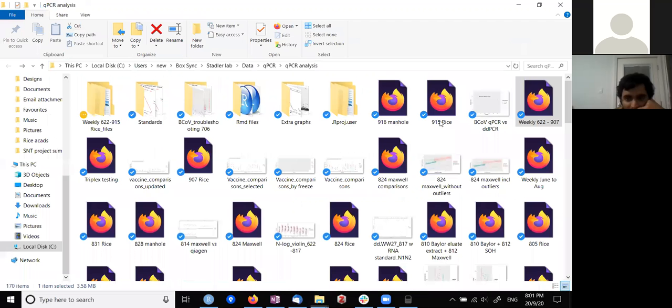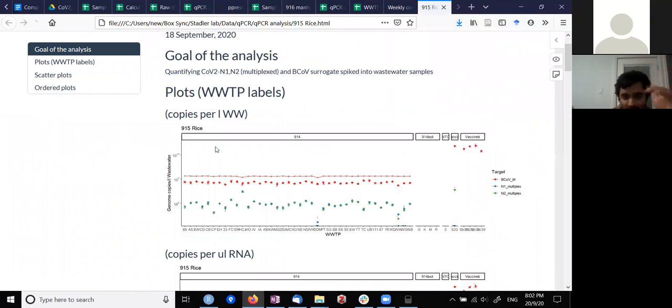And the other file that it was outputting previously, the other HTML file. I broke up the data in multiple segments. This is most of the data. Again, there's a lot of things, so the x-axis is very crowded and you can't see much. I don't generally like labels being inclined, so I avoid doing that. But when I have multiple categories of data, for example, the 914 and the NTC, this is the information that you entered here.